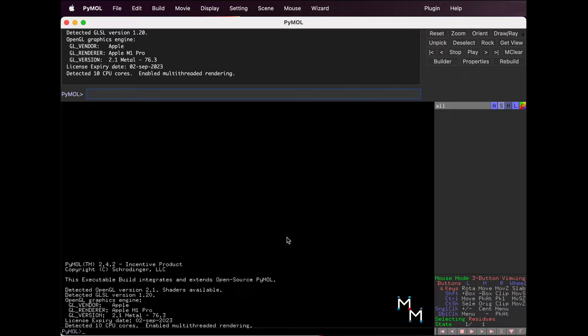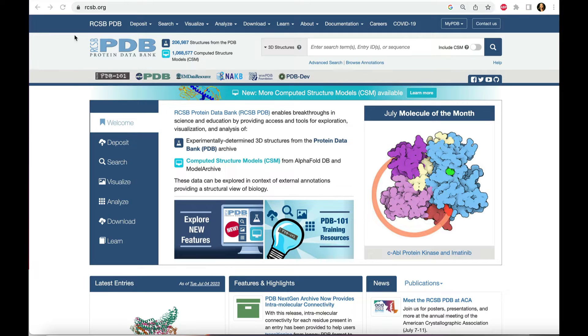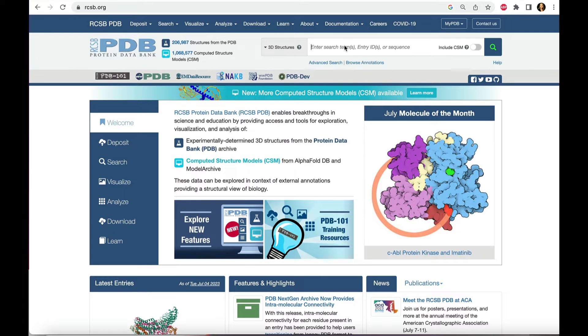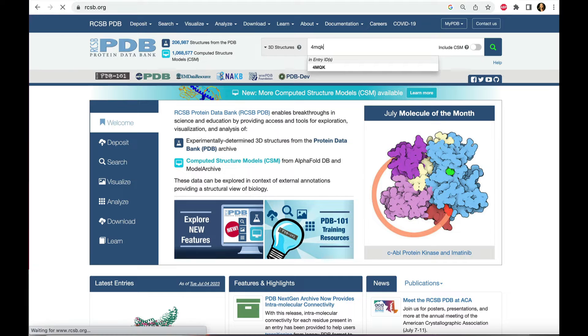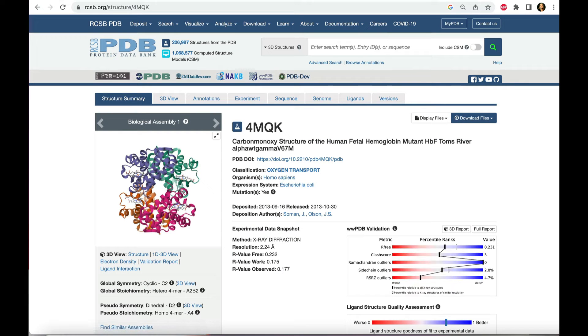We're going to load a structure of hemoglobin from the Protein Data Bank. Let's check it out at the RCSB PDB first. Navigate to rcsb.org and type 4MQK in the search bar.